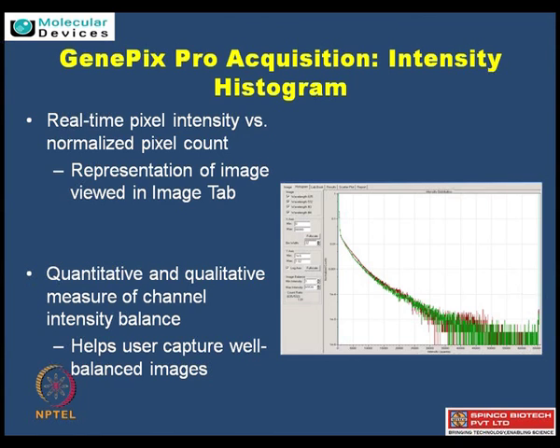That's right. So once you are able to do that, you can see and select whether yes, this PMT is good for me. So this is a way you check which PMT is more suitable. You select a PMT, look at it, see the overlap. Wherever there is the best overlap without saturation, you want to go with those settings.